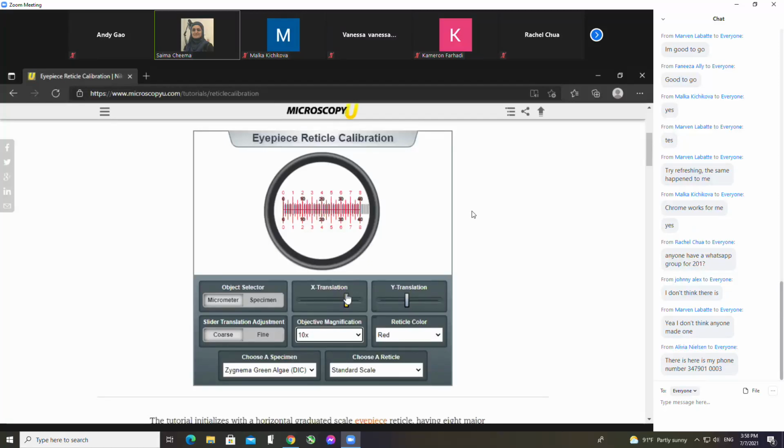Can you do just 10 markings or 20 markings? Try 20 markings on the stage. You just have to have something equal one of these stage rulers. As long as you know how many markings of the ocular ruler fit into the stage markings, you can do a comparable proportion, and we just need to figure it out for one. It doesn't matter whether we measure the whole ocular ruler or just a portion of it. The Y translation is the issue right now for me.